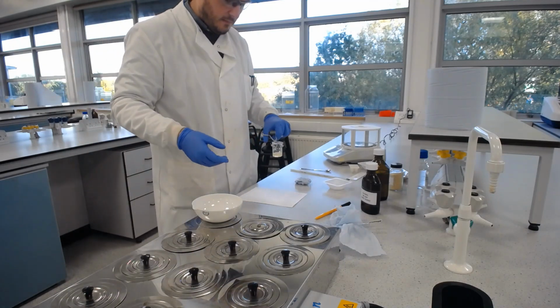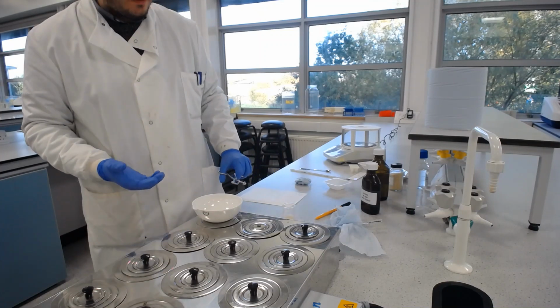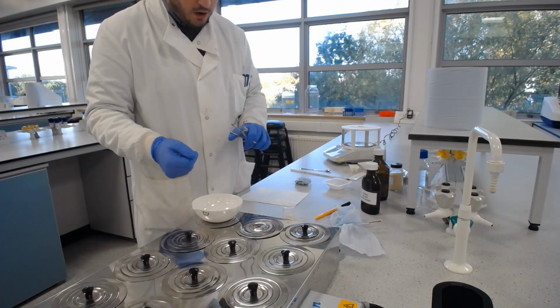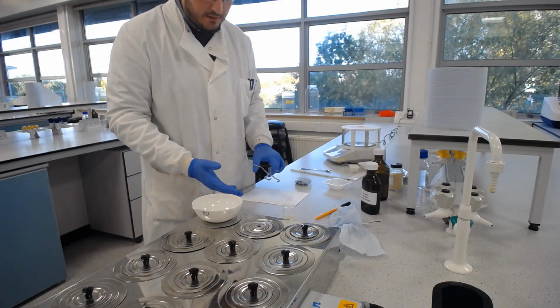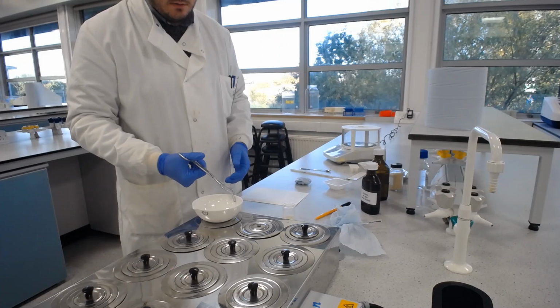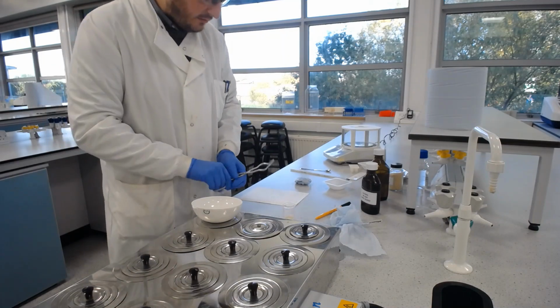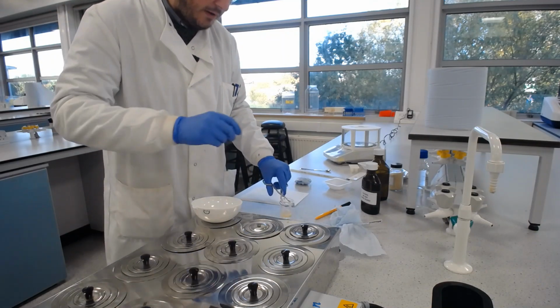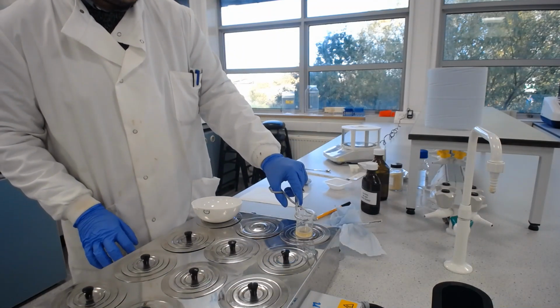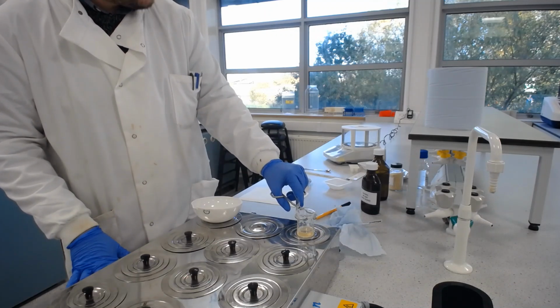Now I've got, obviously, my evaporating dish here with my now heated glycerol in it. So, you've got two choices, I suppose. You can pour, I would like to pour from the evaporating dish into the beaker and mix it, but the problem I've got with that is I'm going to have to use my tongs to pick up the evaporating dish, which is not necessarily the best thing to do. But you can see we've got a lip here on the evaporating dish as well, so I can pour from the beaker into the evaporating dish. So I'm just going to make sure that this is warm enough to pour, and I'm going to go that way around and then pour into my moulds.